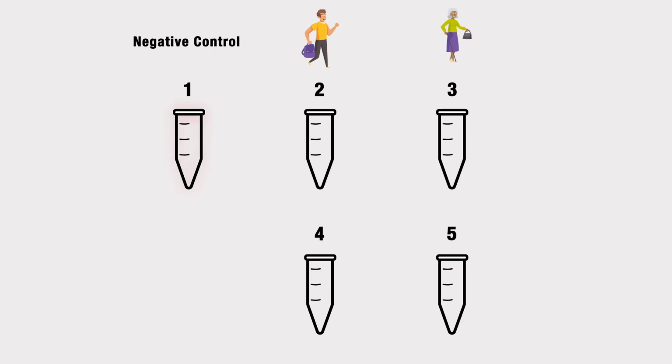The first is our negative control, which does not contain any cDNA. Excluding the template from the reaction allows us to verify that any changes in transcript levels we observe are due to the correct amplification of our cDNA and not some random signal.